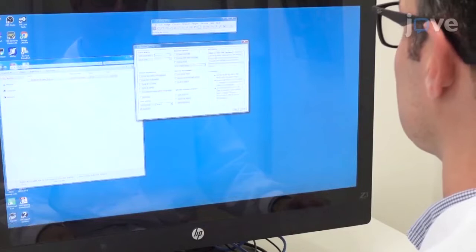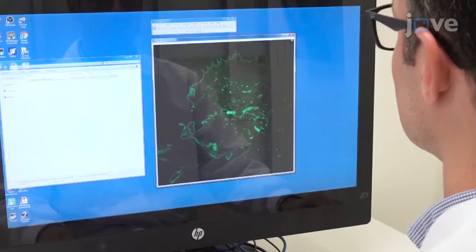Next, follow the immuno-cytochemistry and confocal imaging protocol in the accompanying text protocol, paying close attention to the settings used during collection and load the acquired datasets into Fiji. Oversaturation must be avoided. The final images must contain pixel sizes of less than 0.1 micron squared.